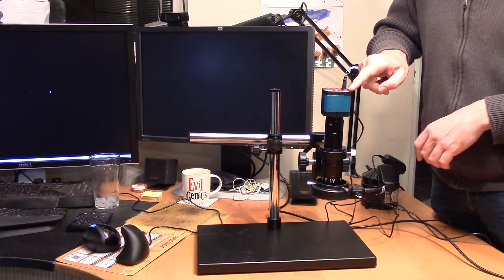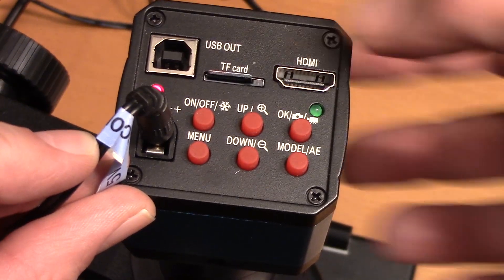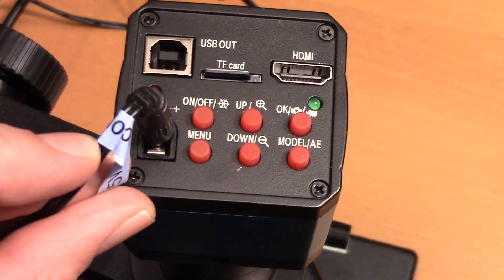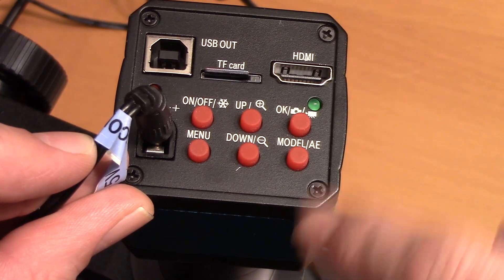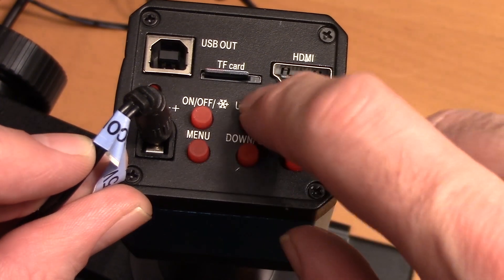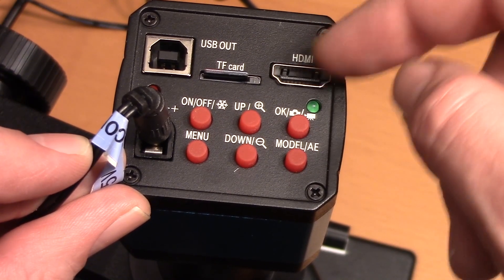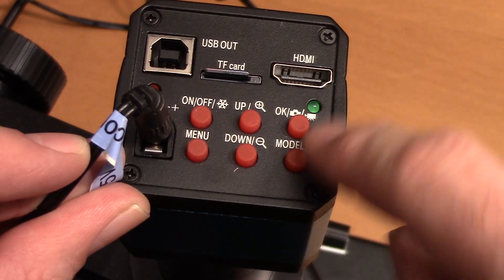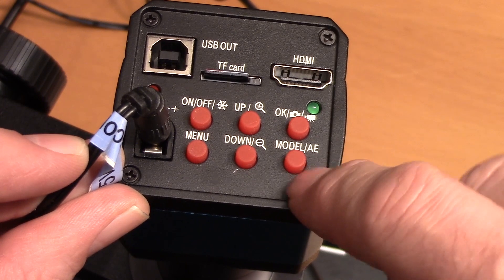Hopefully the lights come on. Just to give a better look at the rear panel: we've got USB output, somewhere for a micro SD card, an HDMI socket — which I keep calling 'hide me cables' because I keep losing them. On/off, and the little snowflake icon is freeze frame, which pauses the image. Zoom in and zoom out. This has got a 14-megapixel sensor outputting 1920x1080, so you can zoom in and out on the sensor. Menu button, take photos or start/stop recording, and what mode it's in — photos, movies, or playback.